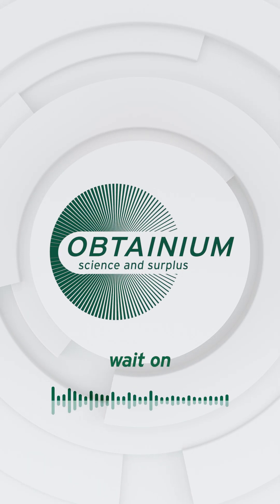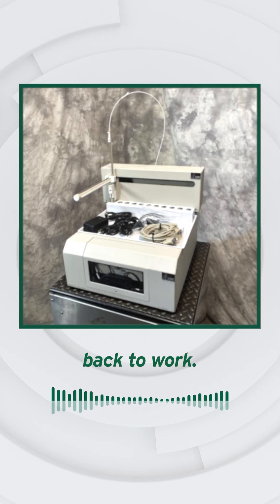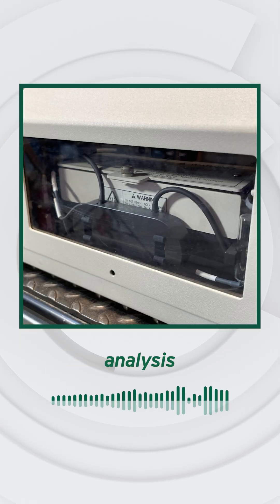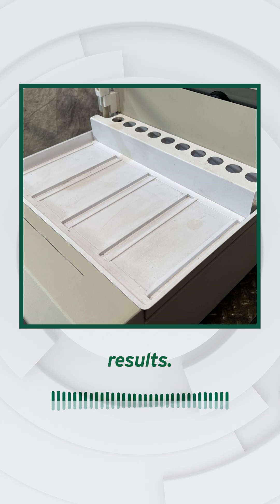Backlog building up while you wait on a new analyzer? Bridge the gap with a proven legacy system you can put back to work. This SeaTac M6000A Mercury Analyzer with ASX500 Auto Sampler delivers precise mercury analysis for environmental and industrial labs, handling high sample workloads with dependable results.